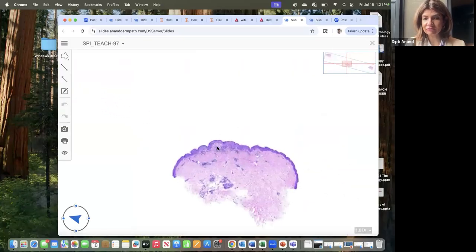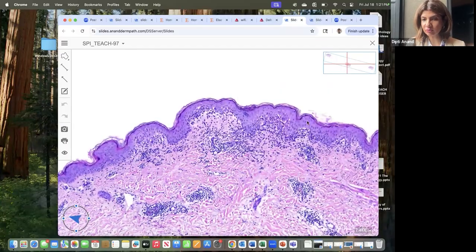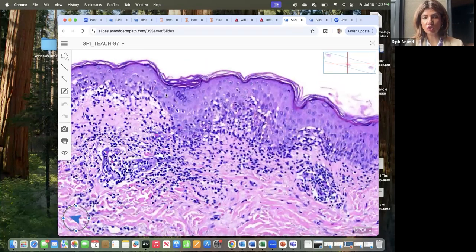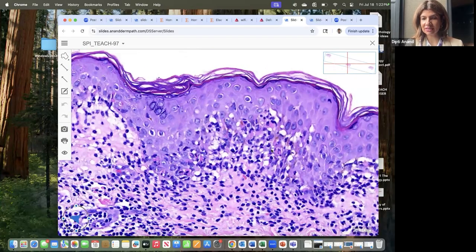So both EM and fixed drug eruption are acute interface dermatitis, wherein you get an intact stratum corneum, no thickening of the basement membrane. Okay. And you have all these necrotic or dead cells in the epi. You see the vacuolar alteration, and you see the necrotic or dead cells in the epi, which are at varying levels with an intact stratum corneum.